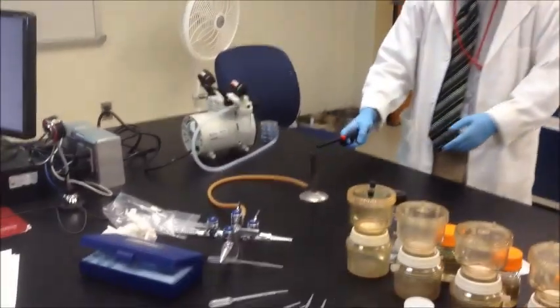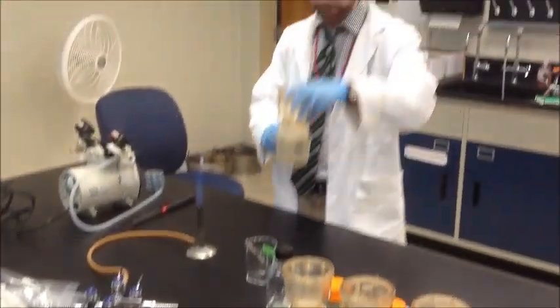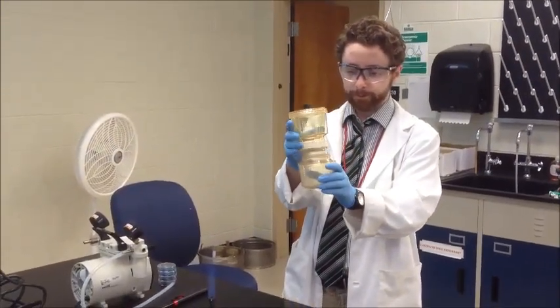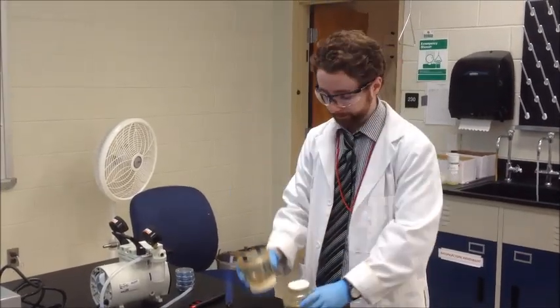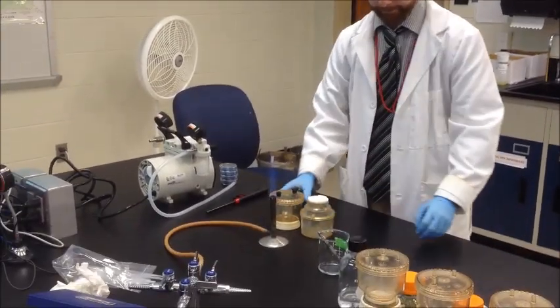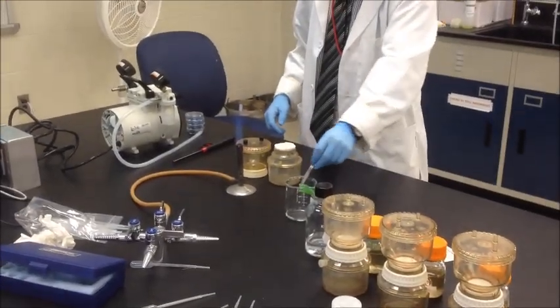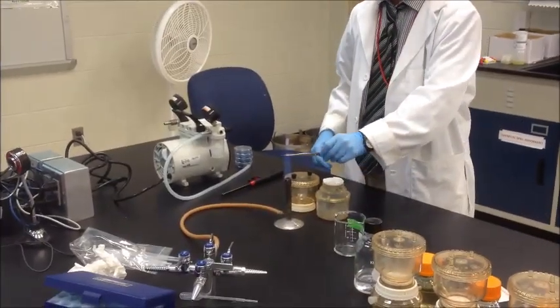Okay, so to begin, I will turn on my Bunsen burner. I will then take my chamber here and I will unscrew it. So this is the chimney portion and this is the catchment vessel. And we'll put these down here. Next, I will take my forceps that are in ethanol, tap off the excess, and pass it once through the flame.